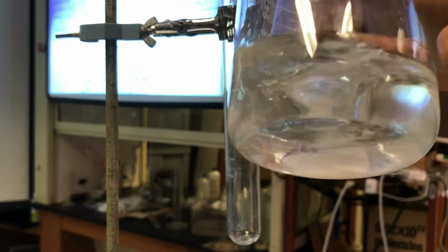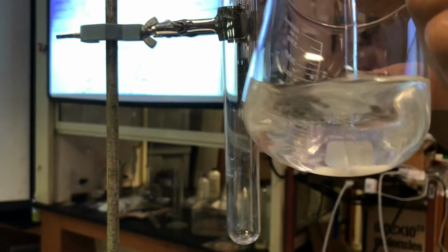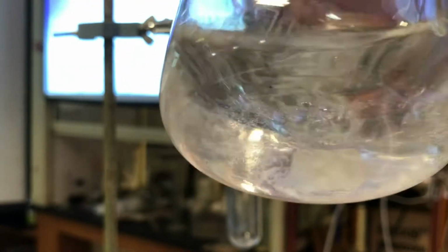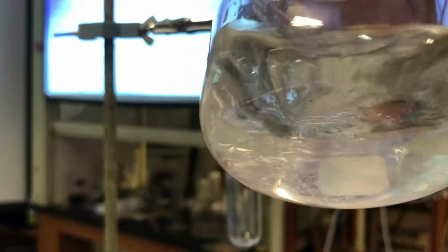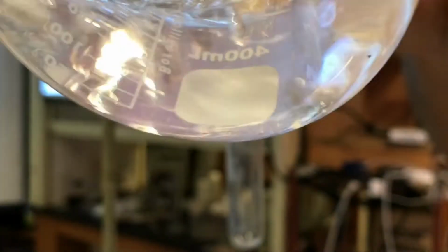Because it's soluble, what will these solids do? The solids should dissolve, which means I'm making a homogeneous mixture. Okay, cool beans. It's almost there. Definitely a lot less solid than there was, right?